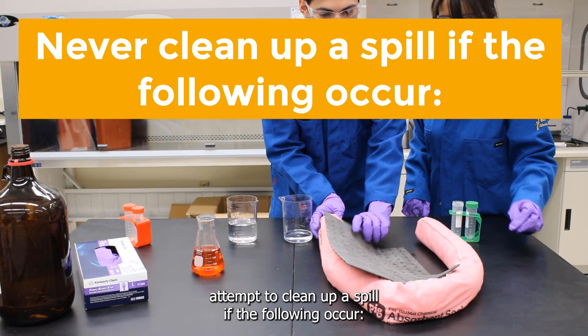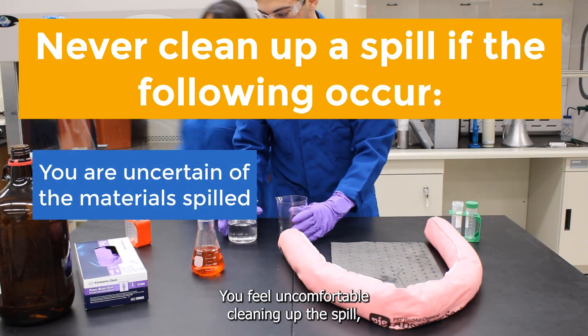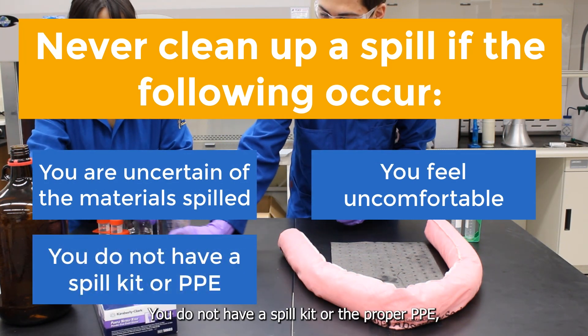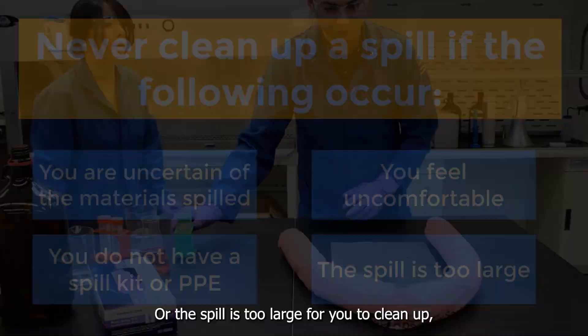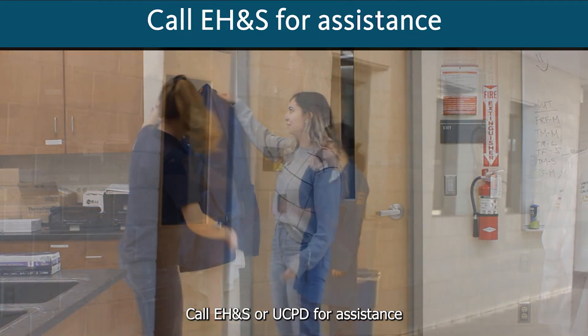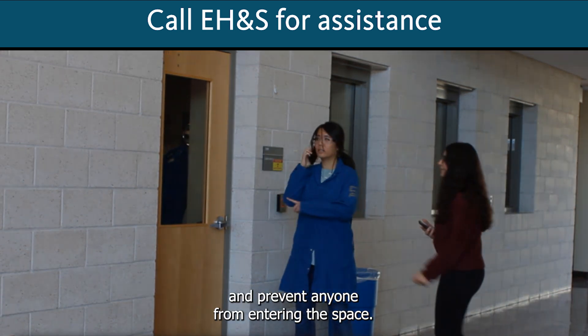You should never attempt to clean up a spill if the following occur: you are uncertain of the materials, you feel uncomfortable cleaning up the spill, you do not have a spill kit or the proper PPE, or the spill is too large for you to clean up. Never enter a space you suspect to be contaminated.